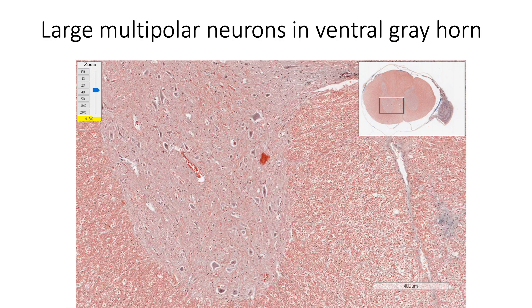Grey matter consists of neuronal cell bodies, their dendrites, beginning of their axons, and termination of axons in the descending tracts, along with neuroglial cells. Ventral horns show large multipolar neurons whose axons form the efferent ventral roots of the spinal nerves. Dorsal grey horn and grey commissure show relatively small-sized neurons. Neurons having related functions are grouped together in both ventral and dorsal horns to form nuclei.